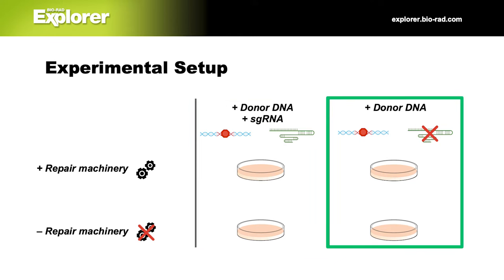Here's 3 of the phenotypes that you're likely to see in the lab: no bacterial colonies, white colonies, and blue colonies. We don't want to give away all the answers in this video, but take some time to think about which phenotype you'd expect to see for each of the samples that we explained before. What happens when DNA within lacZ is cut and repaired with a stop codon? What if it's cut but not repaired? What if it isn't ever cut? Okay, let's get started with the lab.